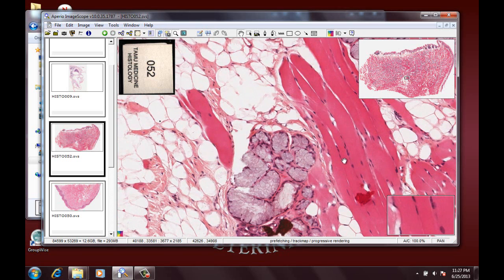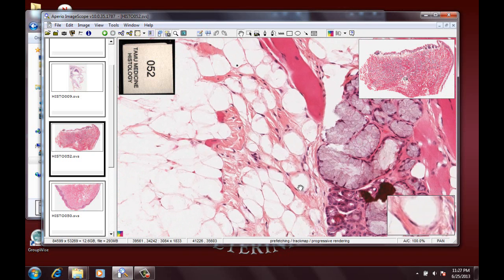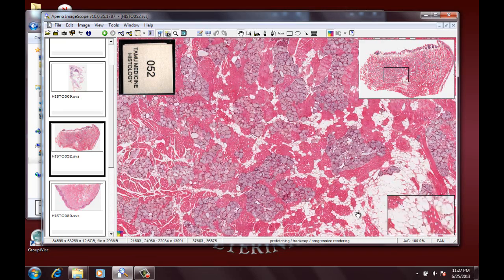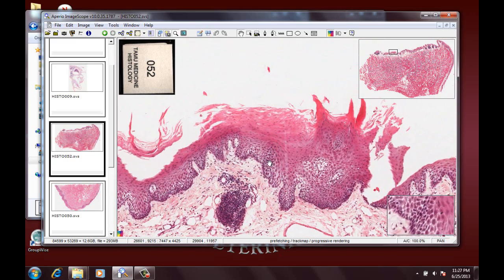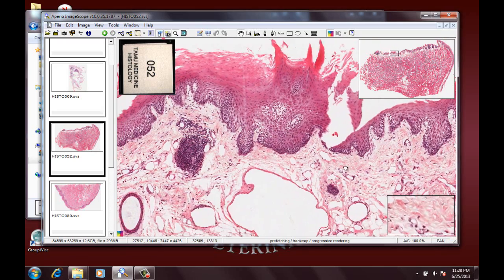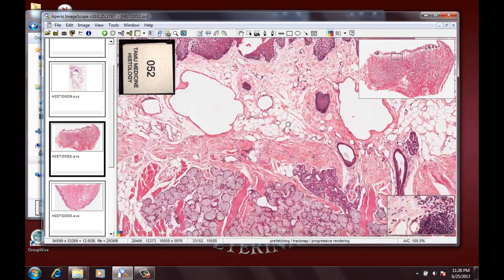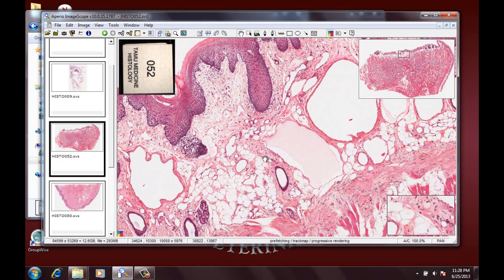Here we see more skeletal muscle cells, long cells, more mucus secretion. These are white fat cells. This will be one cell itself, and this is a fat globule that we see inside there. Here we see epithelium. This is stratified squamous epithelium associated with the little projections in the tongue. So this is the epithelium on the surface, and then the connective tissue below there, and then of course we have muscle below that, and then we can see different glandular structures in through there.